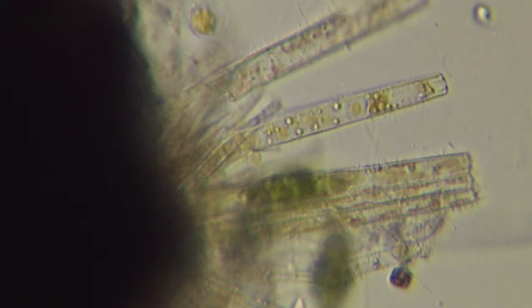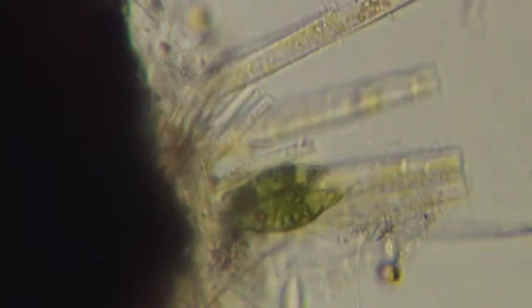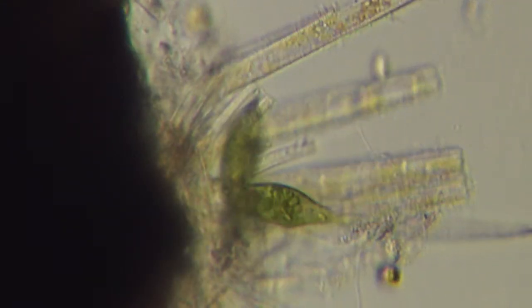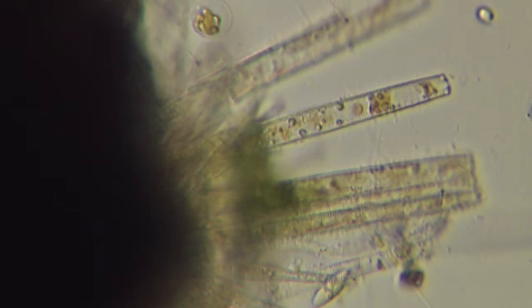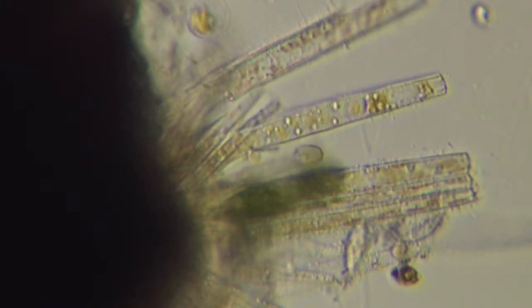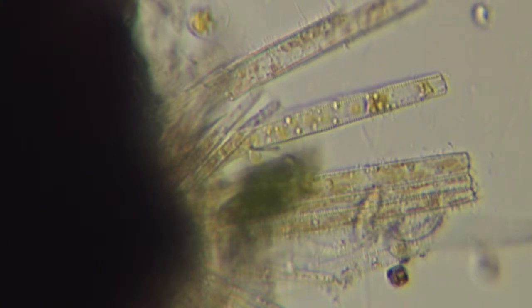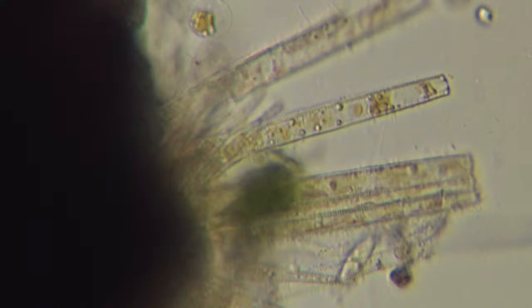supposedly is used in their locomotion, how they exude this kind of mucilage to help them swim. But the last article I read on that was kind of suspect. I think they're still trying to figure out that whole thing. But I'm behind on some of the literature. It definitely wasn't understood very well about 20 years ago when I was starting to look into this stuff a lot. Or more than 20 years ago. But I'll have to do some more reading about it.